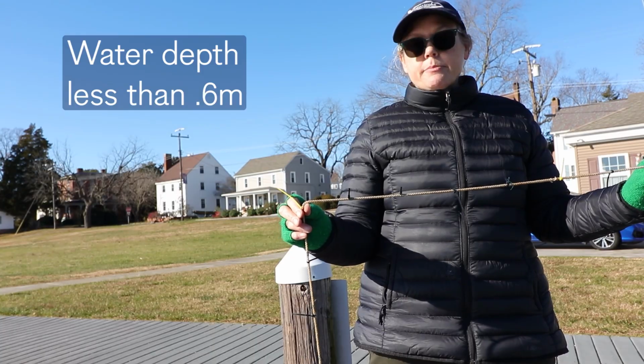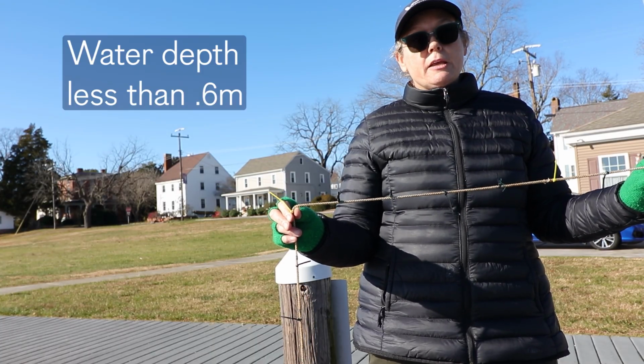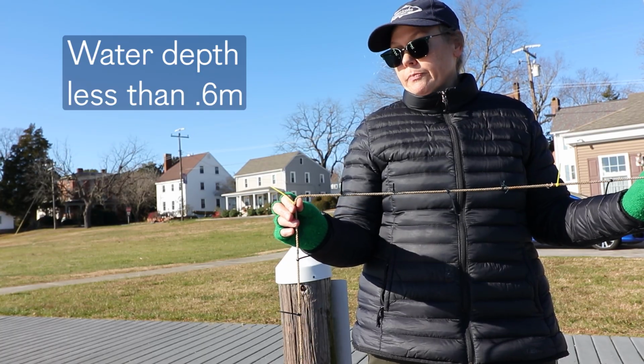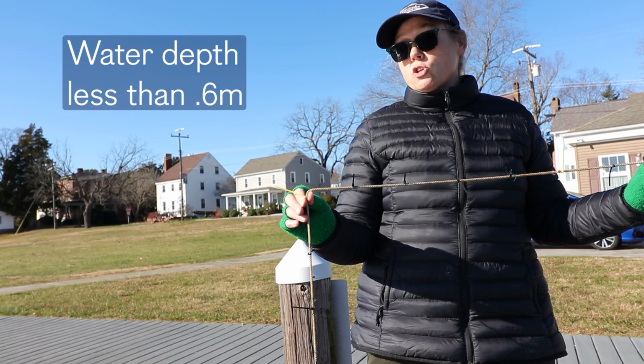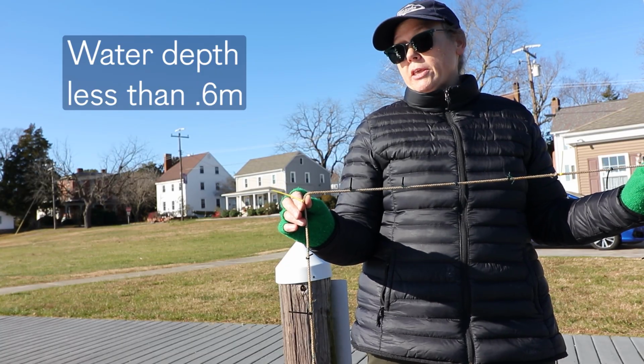At other depths that are at least 0.6, we make our calculations differently, which we'll cover in just a minute. But here at the shallow water site, we divide it into half. 0.5 divided by 2 gives us 0.25, and we're going to round that to 0.3.